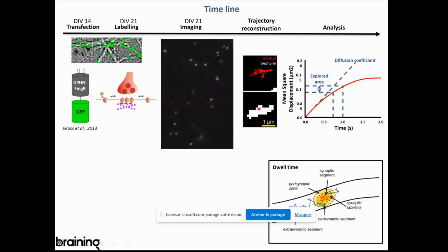It means they momentarily lose their fluorescence, which then recovers. And this is really a particularity of the quantum dot. It has this property to blink, which is very interesting for us because it's a way to see that you have only one fluorescent molecule at a time and not two or three. In this case, they won't blink at the same time.